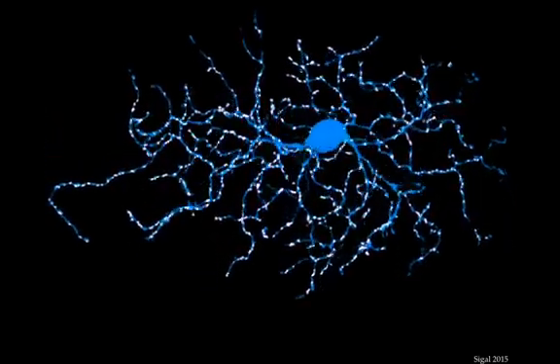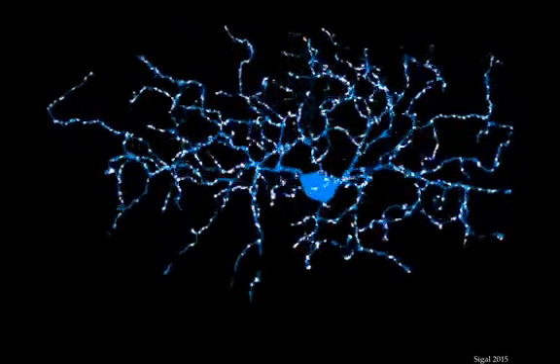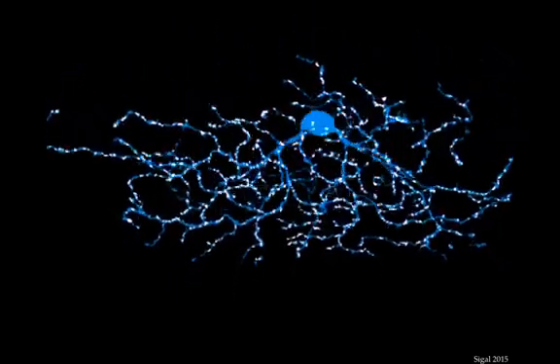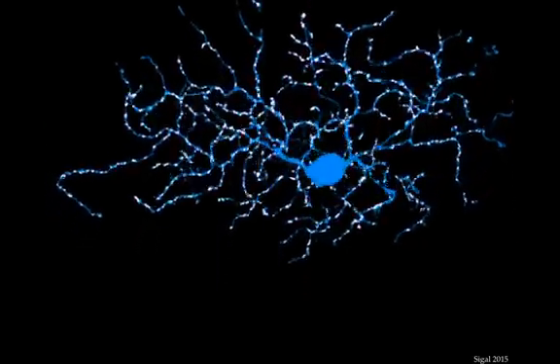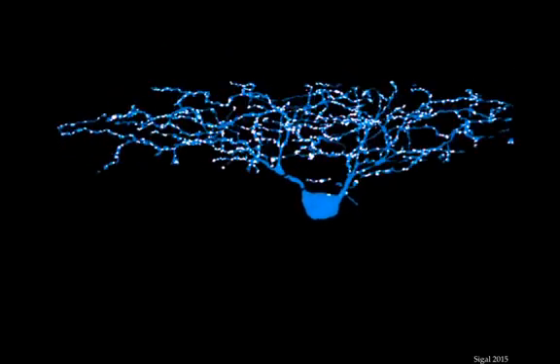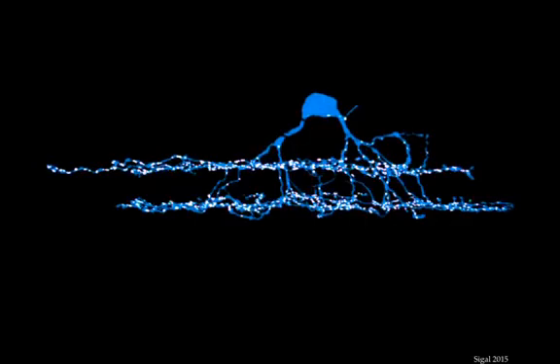This potentially revolutionary mapping of neuron architecture fundamentally relies on the particular advantages of STORM as a super-resolution technique by allowing the study of cellular organizations at widely separated spatial scales and then correlating that information. This particular advantage of STORM is going to be applied further by many groups in the future.